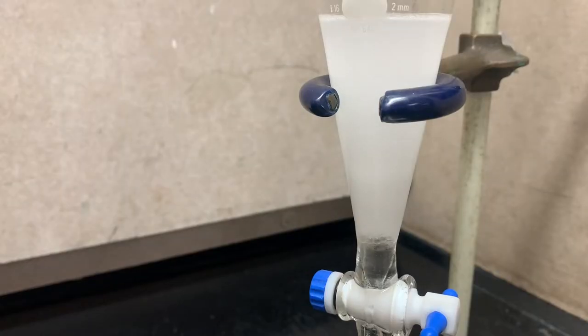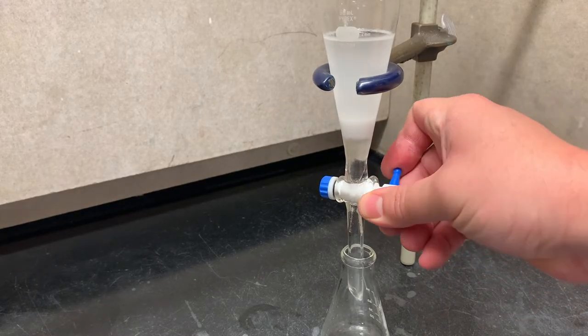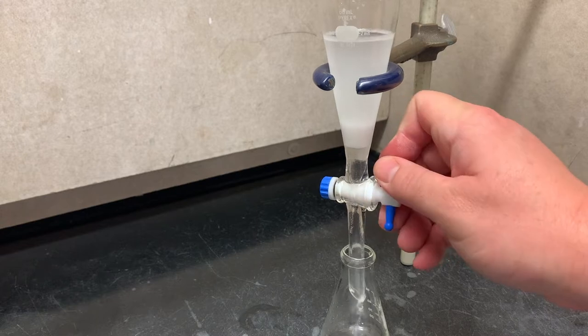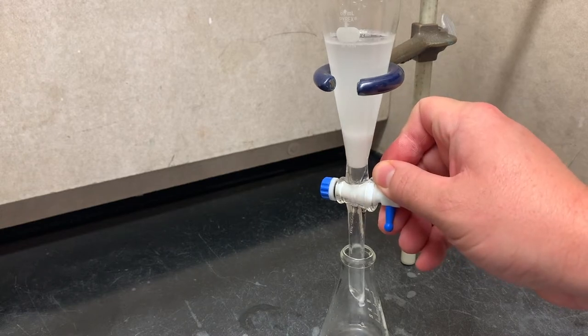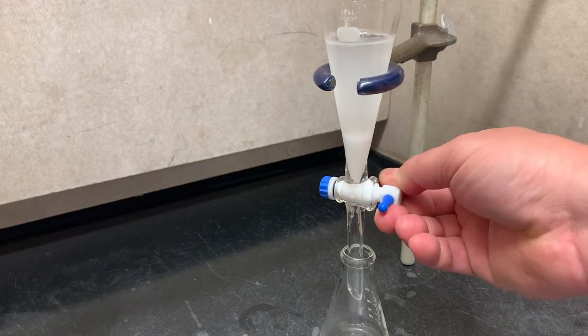Our compound is more soluble in dichloromethane, so it will go into that. And dichloromethane is denser than water, so it will sink to the bottom. Now we can collect our first dose of the organic. We want to get only the organic, none of the aqueous, if we can avoid it.